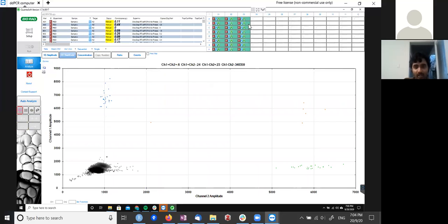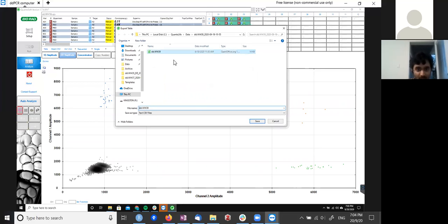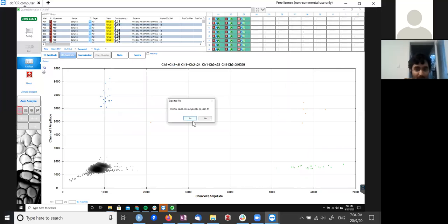Make sure you select all of the points, then do an export CSV and we'll overwrite this file. The original file will have the automatic values, but a few of them didn't have any values because they had errors due to the automatic processing. Previously the points were more ambiguous, so the separation between clusters was unclear.